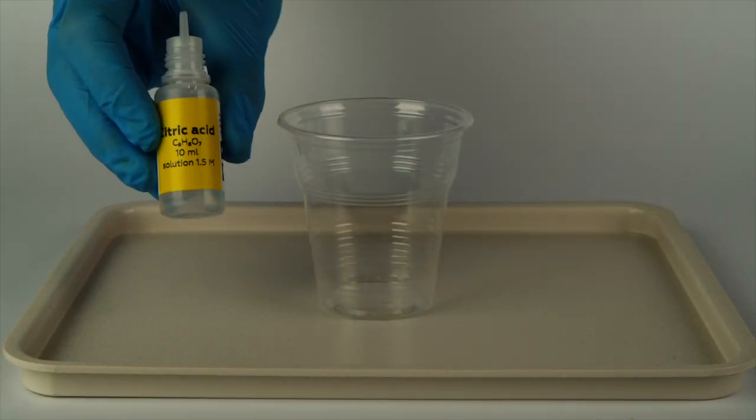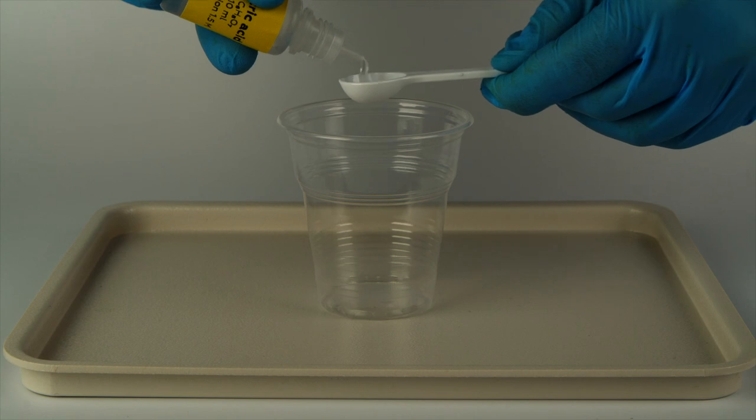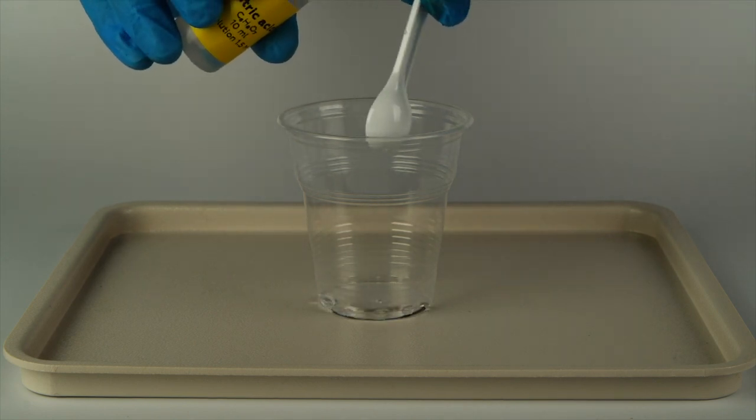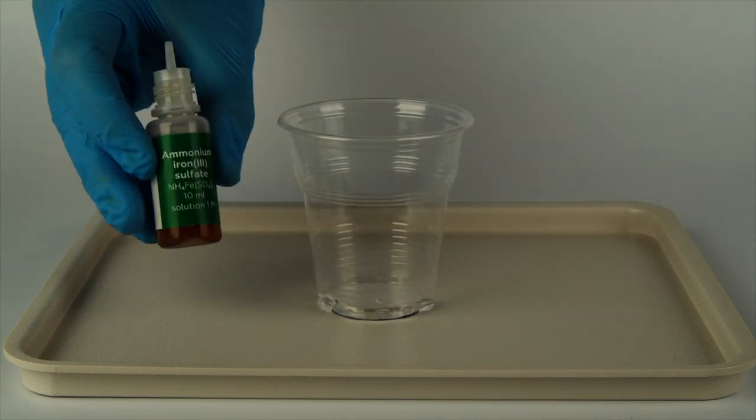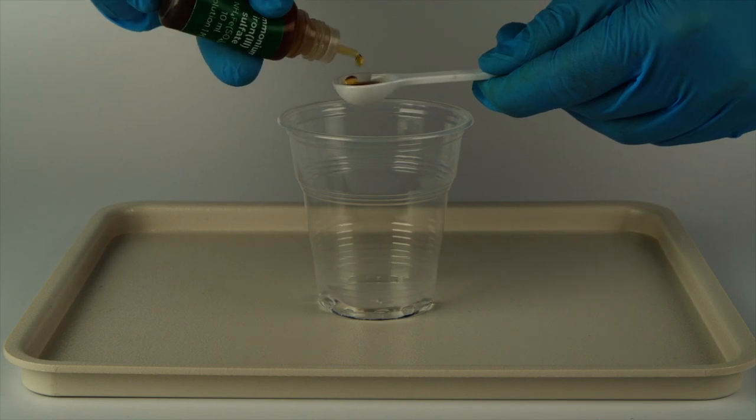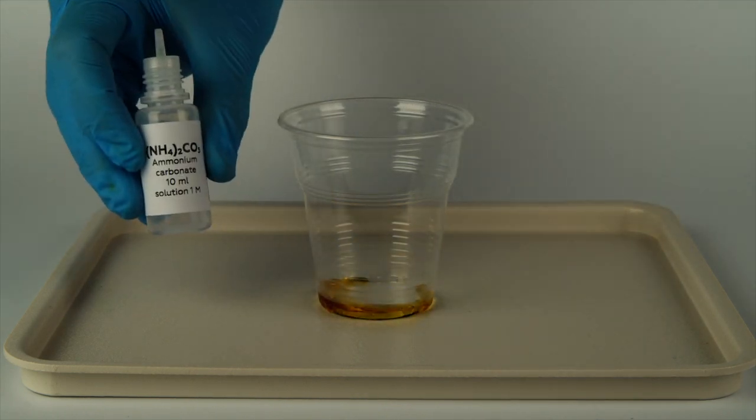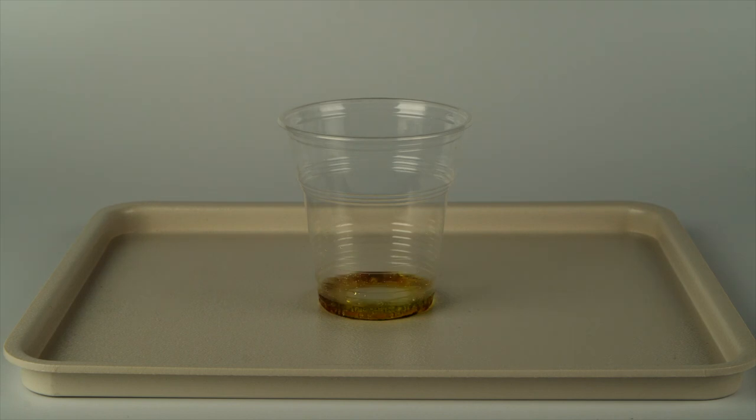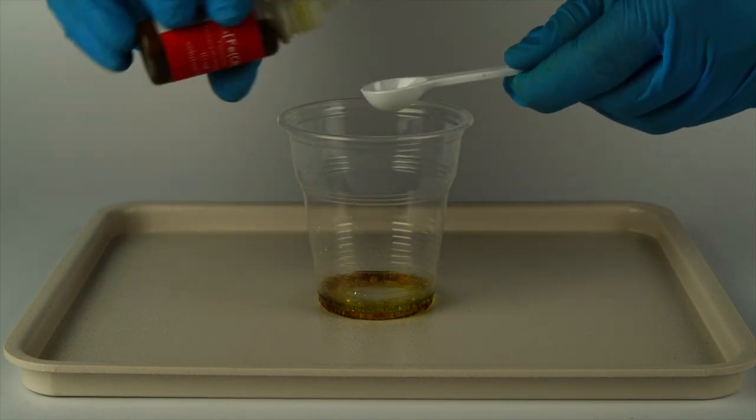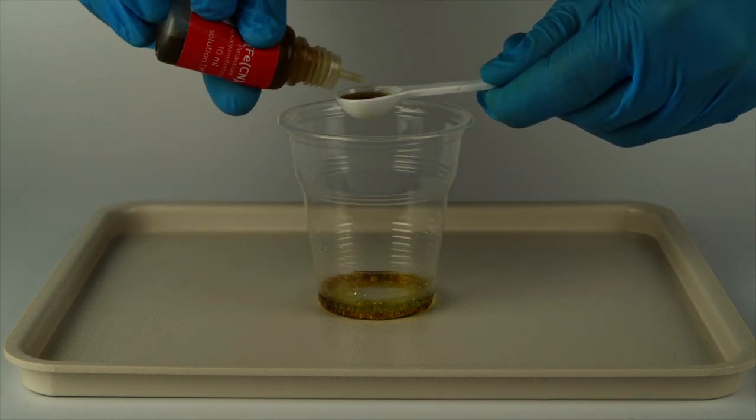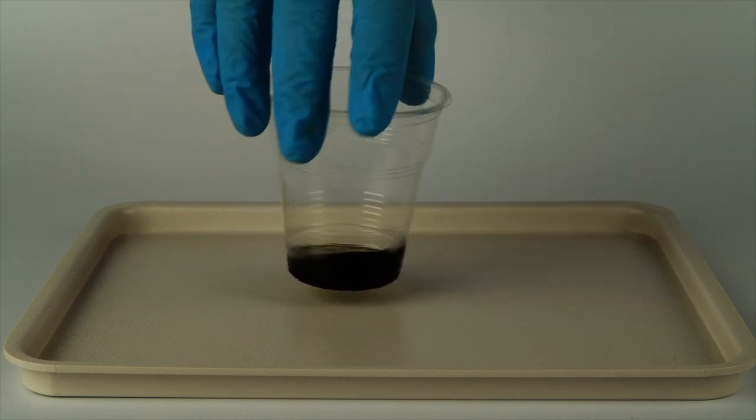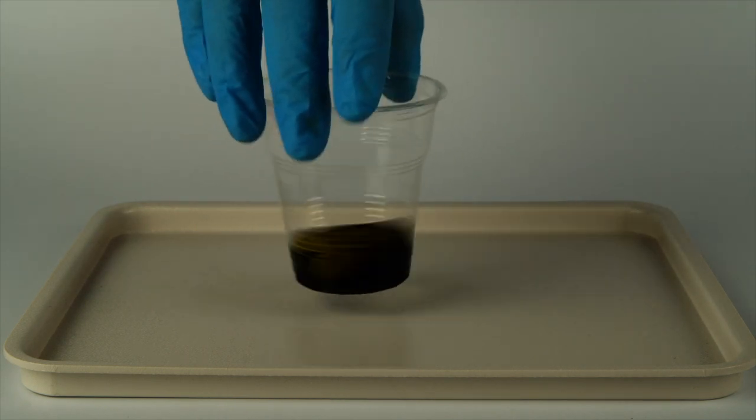First, prepare your light-sensitive mixture. Measure one big spoon of citric acid solution into a disposable cup. Add one big spoon of ammonium iron sulfate solution. Add one big spoon of ammonium carbonate solution. Lastly, add one big spoon of potassium hexocyanopherate solution. Mix the contents of the cup by swirling them around.